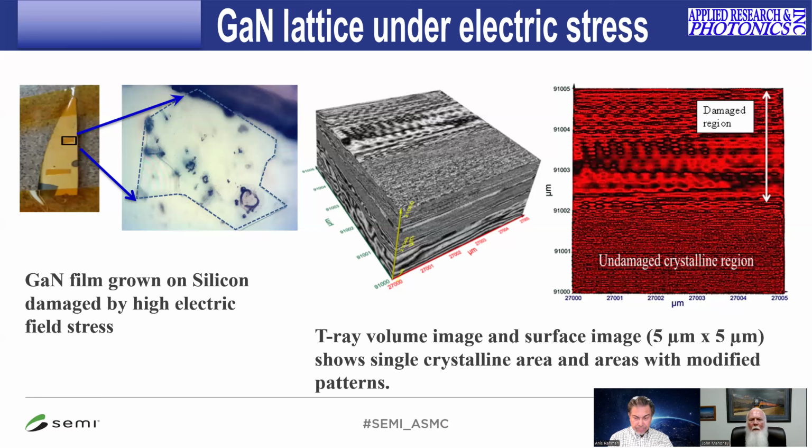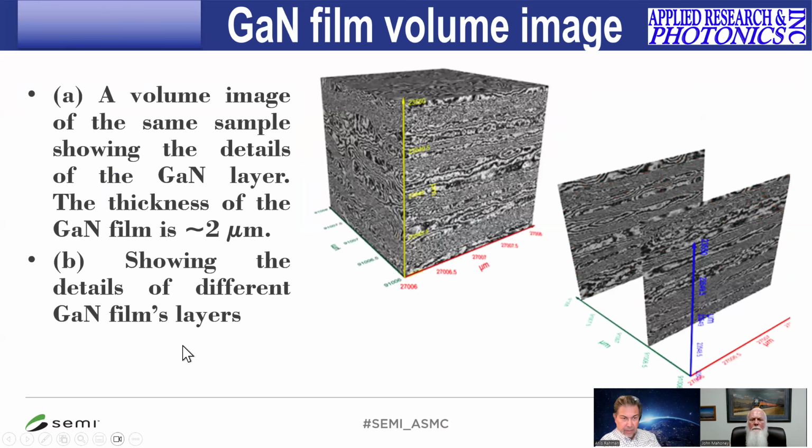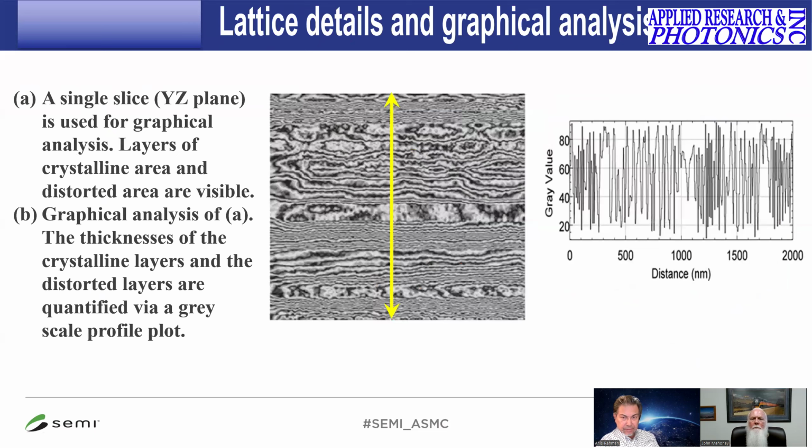So if I may move on. Yes. In the last podcast we also discussed the volume image and the layers, as well as how we can do the measurements of either different layers or the whole structure.